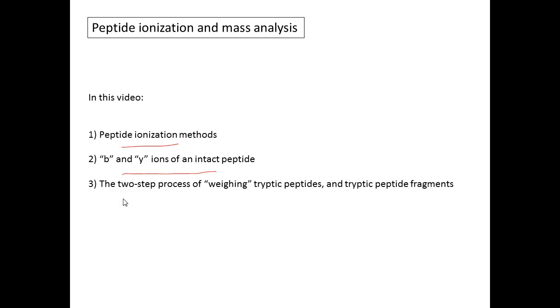And then we'll talk about the two-step analytic process where we're going to quote-unquote weigh the intact tryptic peptides, and then we'll also weigh tryptic peptide fragments. And this will be the key for interpreting the raw data molecularly, that is, matching spectra with protein identifications.